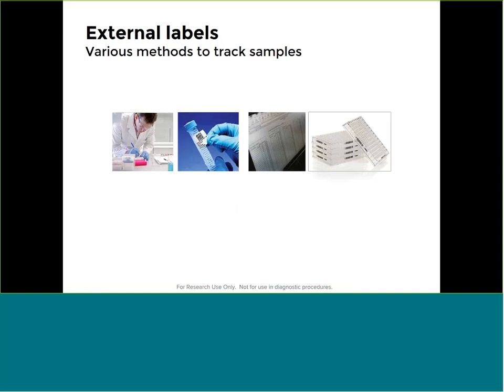Regardless of the downstream application, every sample has a label or a unique identifier so it can be tracked and applied to results of numerous laboratory evaluations. Most often, though, the tubes are labeled manually with a marker or with a sticker with a two-dimensional barcode, and that could also be added to microtiter plates, whether 96, 384, or greater format. The physical sample location within these containers is recorded and tracked in spreadsheets, electronic databases, and even using elaborate LIMS installations.